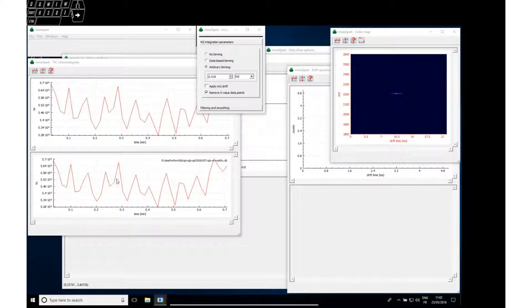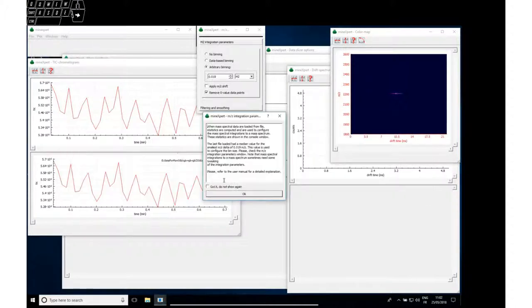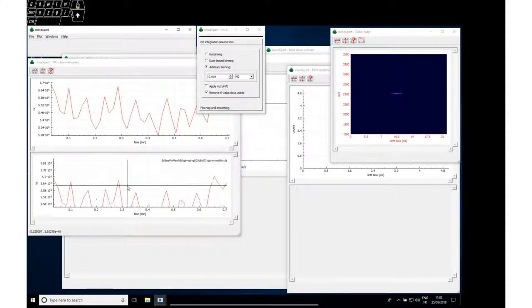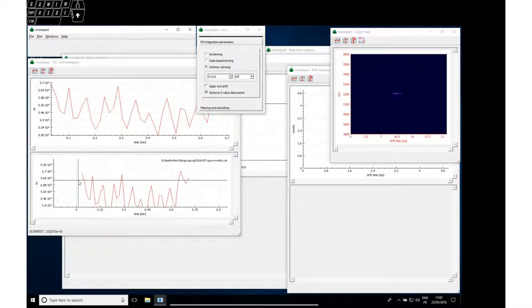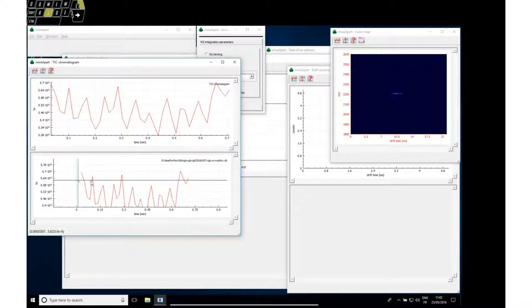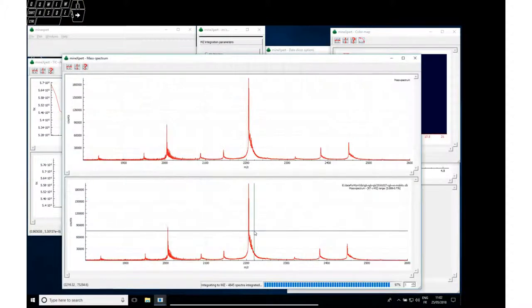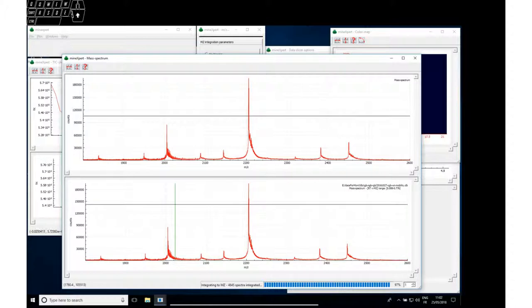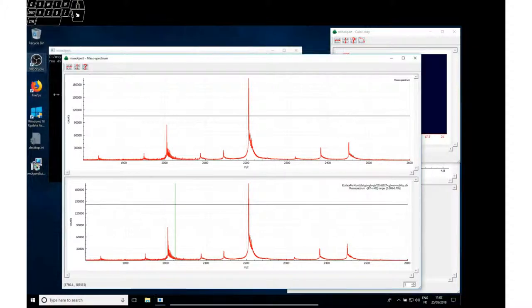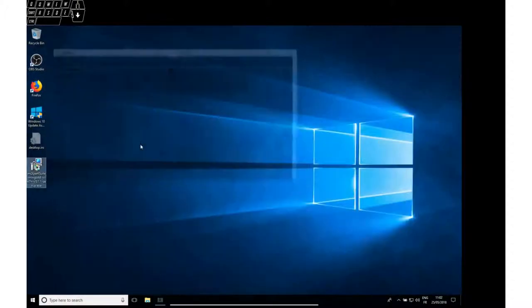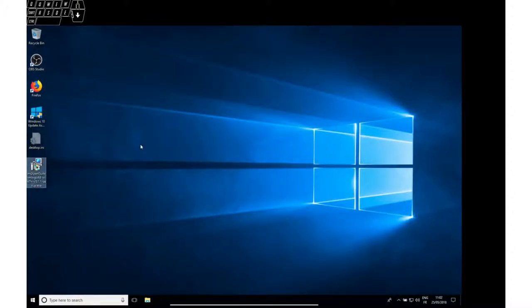Let's check this. Let's perform a mass spec integration. Perfect. The software works. So now you have a functional MS Expert Suite software environment.